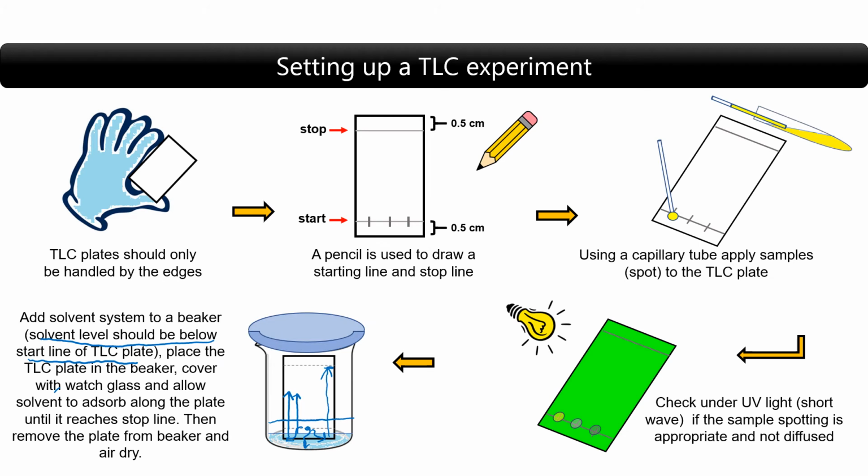And of course, during the time that we call developing the TLC plate or running the TLC plate, we usually keep this beaker covered with a watch glass to ensure that this is like a small chamber completely saturated with the moisture of the solvent system, and that makes sure that the solvent rises across this plate at an even rate.